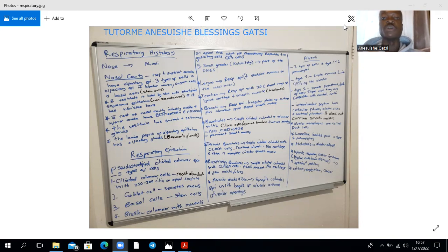The respiratory portion, I would describe with the rest of the respiratory system. Then the olfactory portion will be lined by a specialized epithelium, which is going to be olfactory epithelium. If you look at the vestibules, you expect to find sweat glands and sebaceous glands. In particular, the sebaceous glands' secretions will be important in trapping particulate material that gets into the nasal cavity, right?